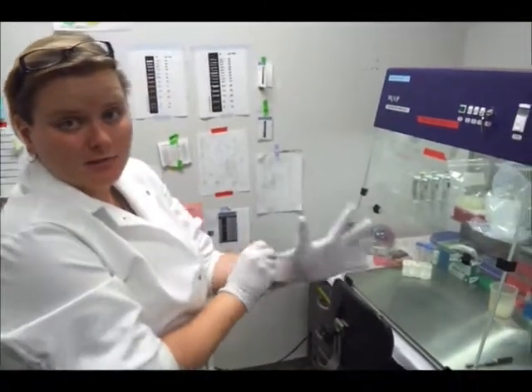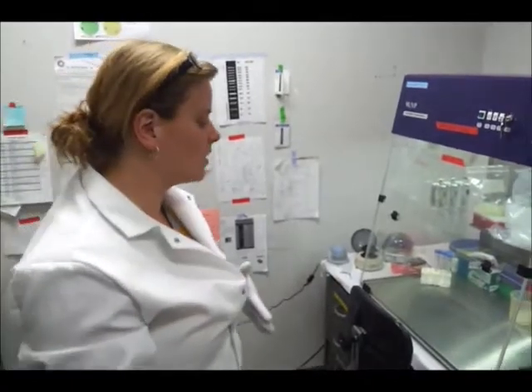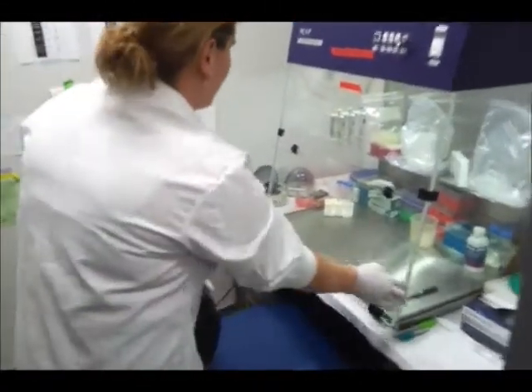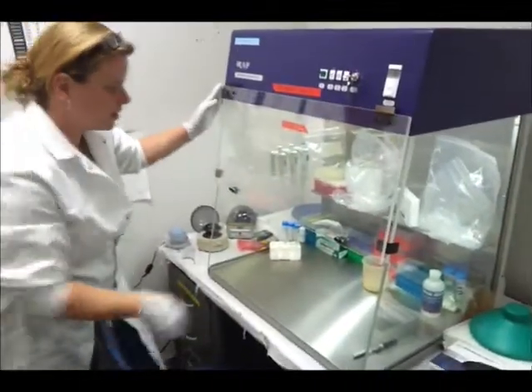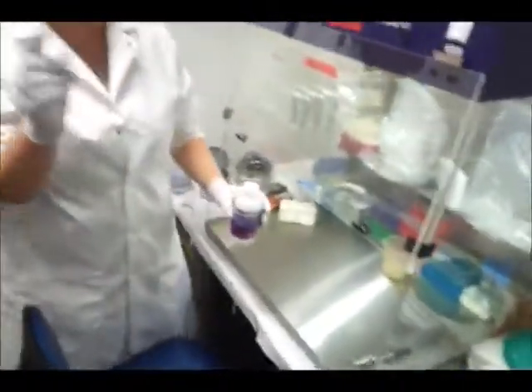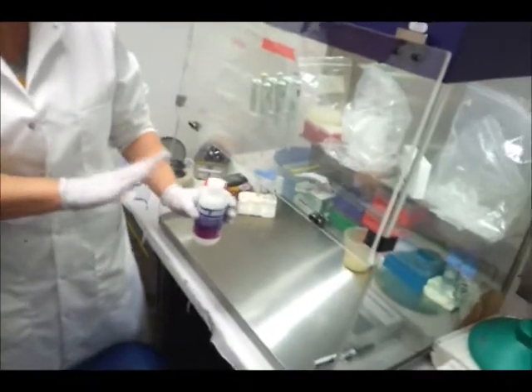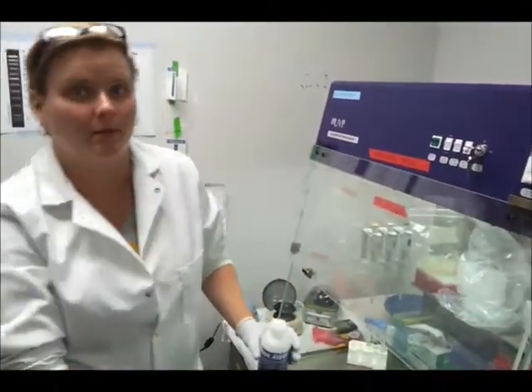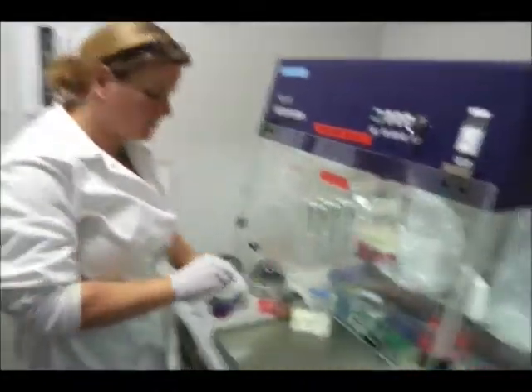Spin down the plate, but in between then and now we have some time between setting up the plate on the machine and whatnot. So I'm going to decontaminate the hood again, and I'm going to do just like I did earlier. Most importantly, I've moved everything that we've done: the plate, reagents, the samples. They're all back on the bench. Nothing's in the qPCR room right now.